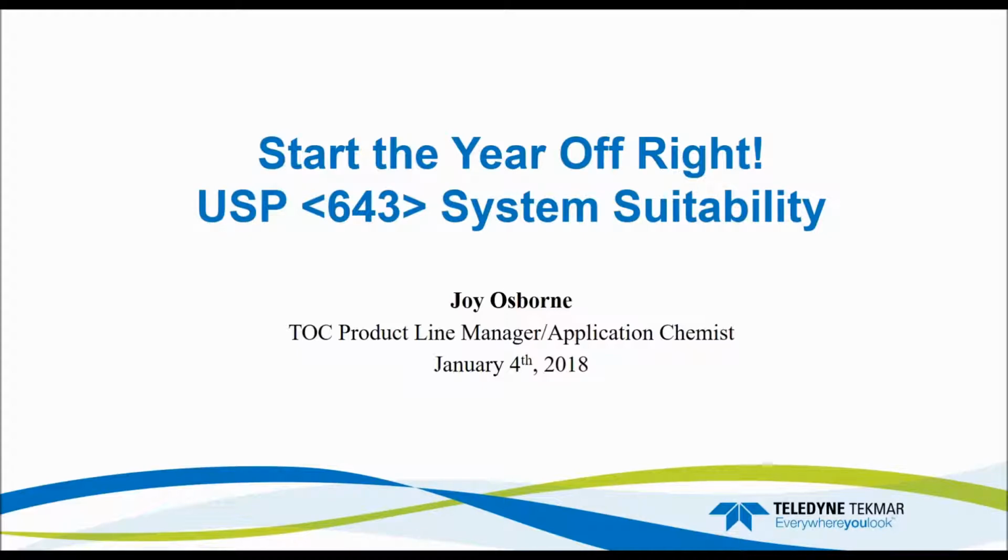Thanking everyone for joining this webinar today on United States Pharmacopoeia Method 643, which is part of the system suitability check. The reason I chose this topic was that the method USP 643 recently changed to include sterile water levels, which are at 8 parts per million. Originally, the method only included 0.5 parts per million carbon, so now it includes both 0.5 and 8 parts per million carbon in the method.